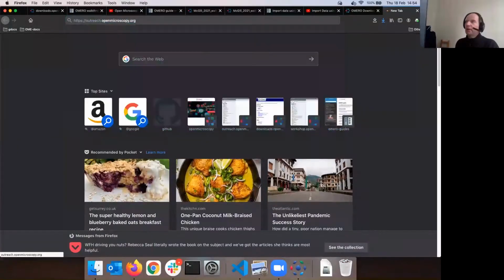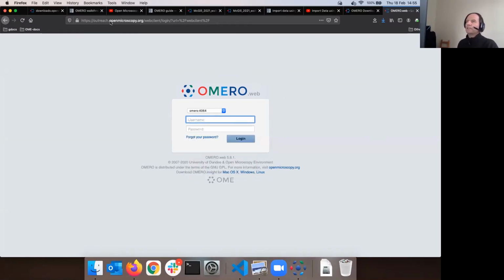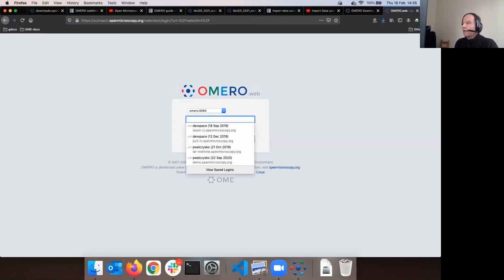Okay, or indeed you can click on some links which appear in the chat, of course, on the outreach link, and be confronted inside your browser. I'm using Firefox. You can, as I said, Chrome, Edge, Safari will work fine. And I'm logging in again. I said user 49 in my case, okay.